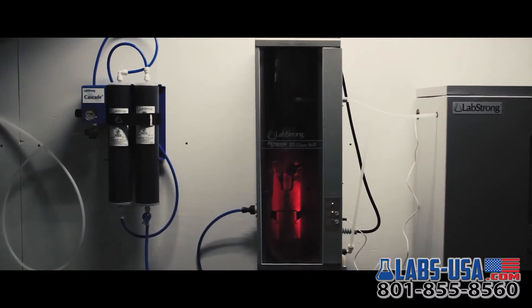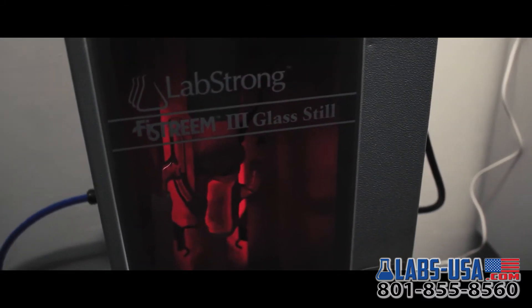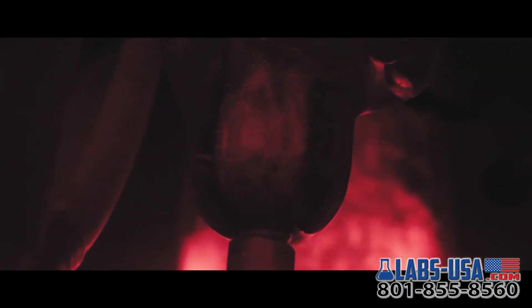You may go home, but the LabStrong Phi Stream 3 is still working. Its fully automated operation will turn on when it senses a drop in the distilled water supply and turn back off when the carboy is full.